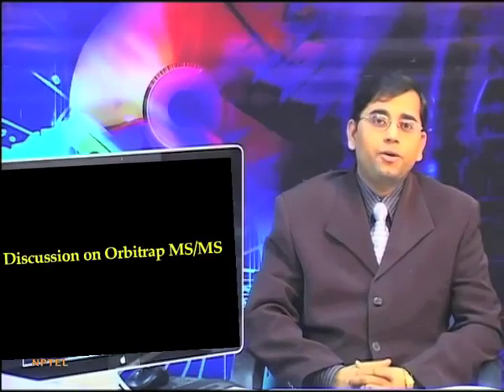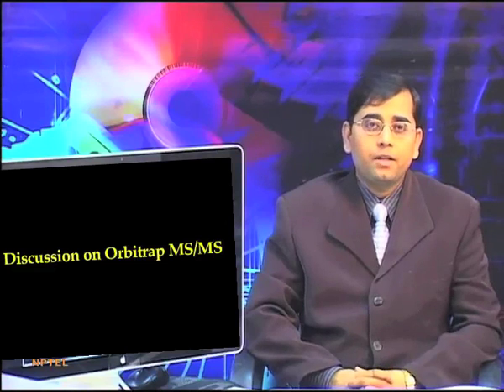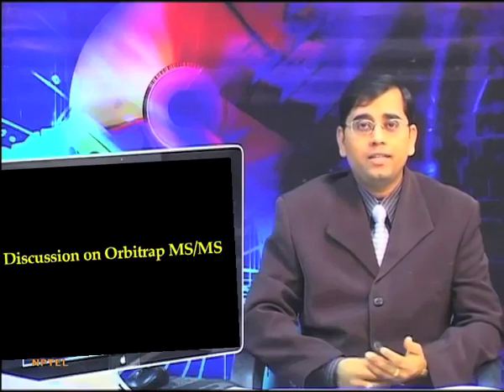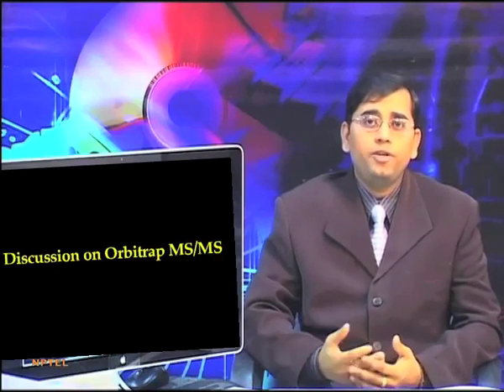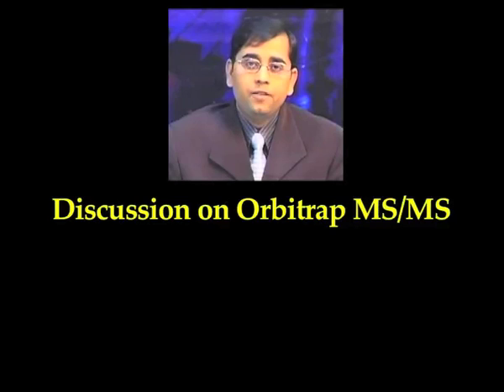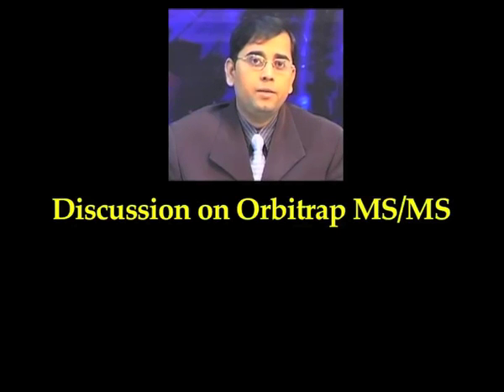So after discussion on the quadrupole time of flight, the Q-TOF as well as triple quadrupoles, now let us move on to another latest configuration, the Orbitrap, which has very much similarity with the ion trap, but it is one of the very latest additions to this proteomics workflow, where people are applying this for various types of biomarker discovery and different other applications.